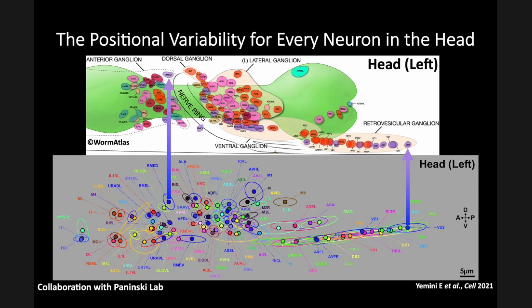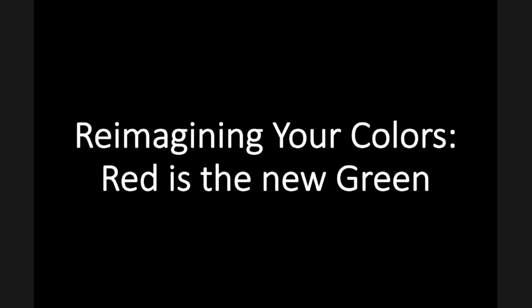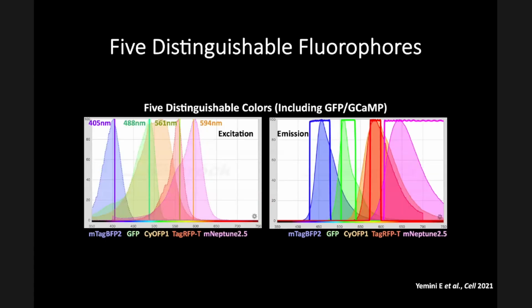We have some limitations to some extent in terms of the microscopy that we need to bring in, right? So let's say we go to fly, there are ways to fillet the animal, there are slices, but let's say we don't want to go to that level. The problem with single photon confocal is that the depth isn't that great, and there's a lot of refraction, and so we would have to bring in multi-photon techniques to get deeper, right? The problem with multi-photon is, and this gets into more detail that's going to confuse people, and I apologize, I'm going to try to get through it as easily as possible.